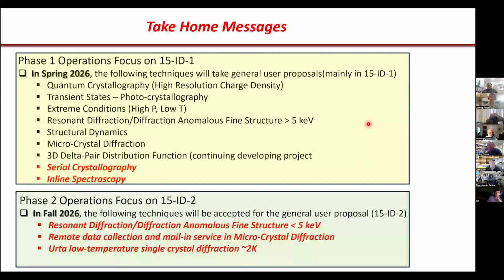Yeah. But maybe, if you bring this on, we do have some Eiger detector, but it's not a high energy one. So we might use it for certain things, but not really for PDF or something to study.